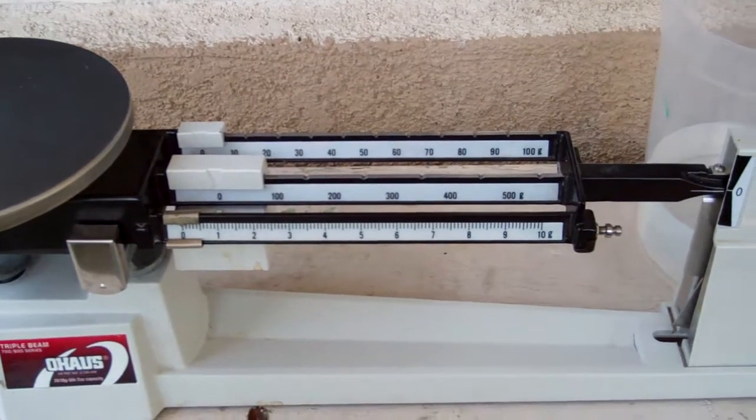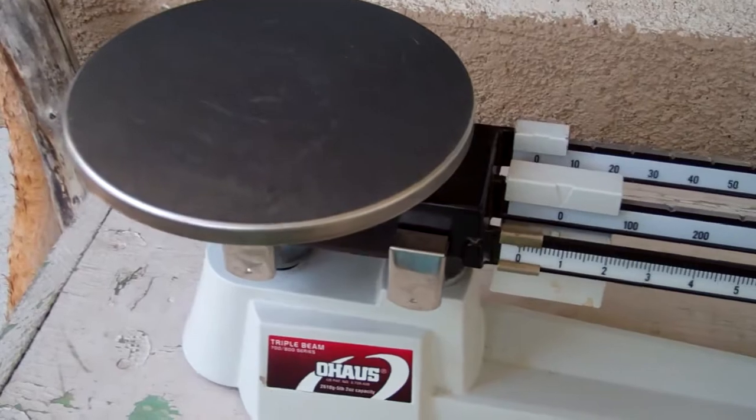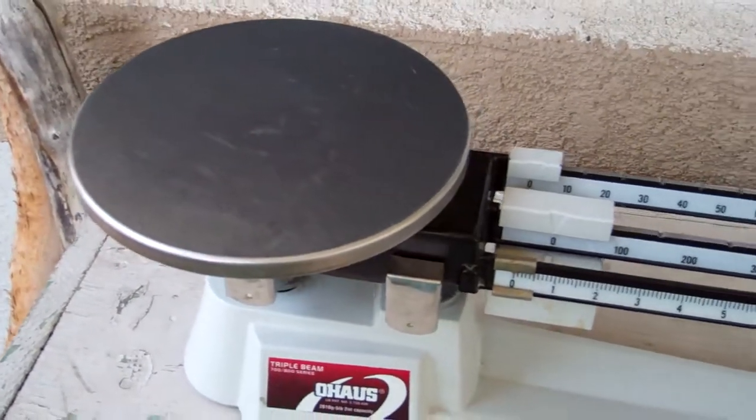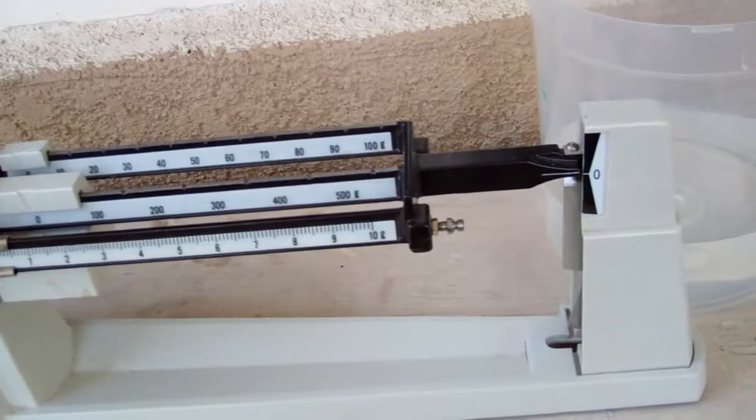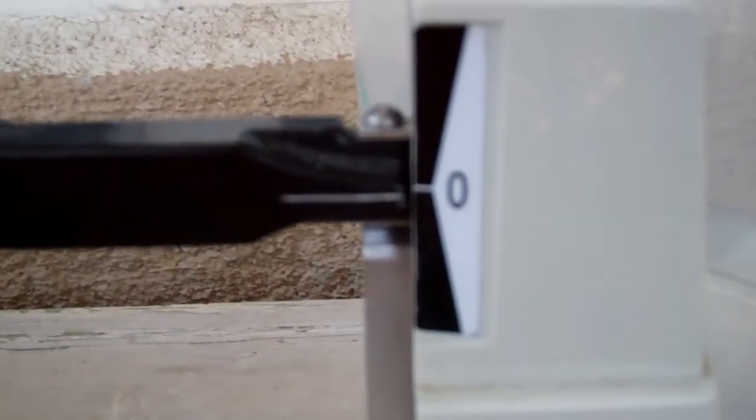And before you use the triple beam balance, you want to make sure that nothing's on the pan. That's the pan. And that the zero line over here on the right is at zero. That's the zero line.